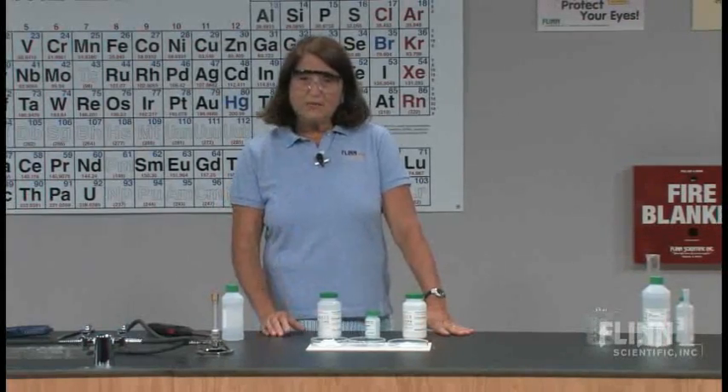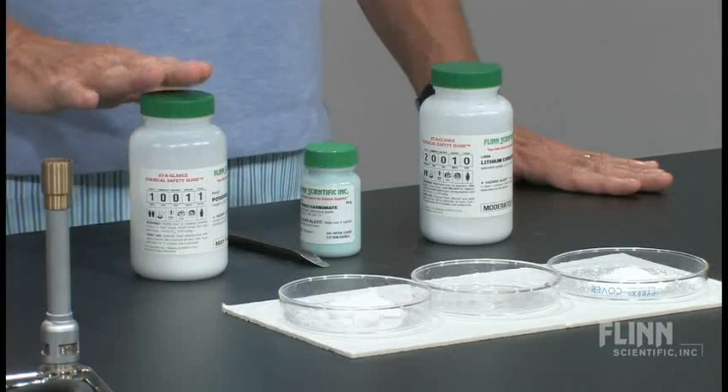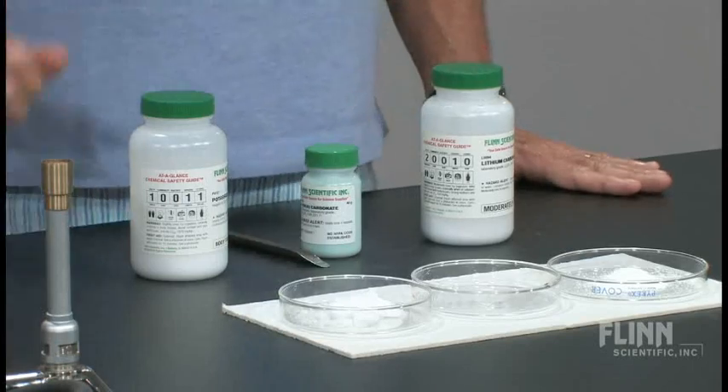What I have is three different carbonates to show you: potassium carbonate, copper carbonate, and lithium carbonate. Those are my three choices.